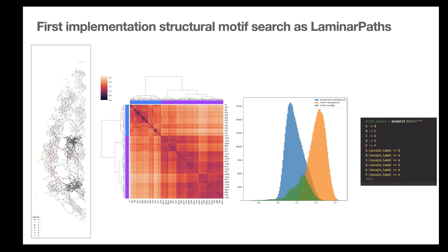If you already have a biological question in mind and can cluster your tissue in a biologically meaningful way, then you can basically just look for structures. And you could also think about this for graph convolutional networks, learning this de novo, but that's where I am at now.